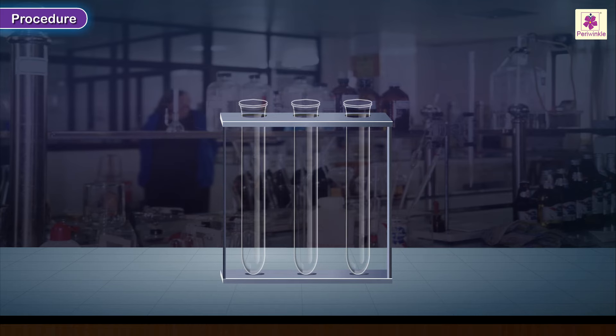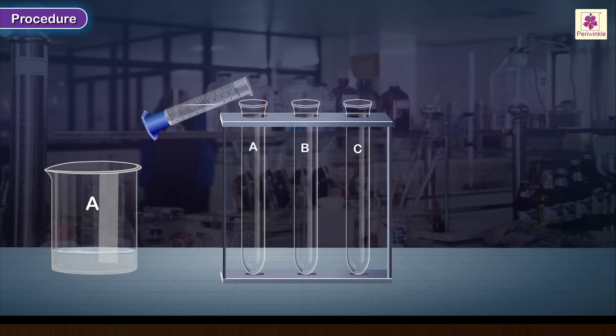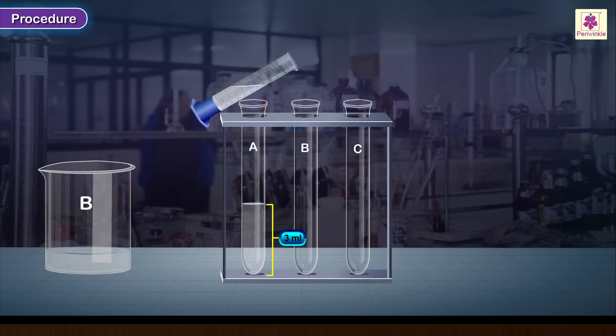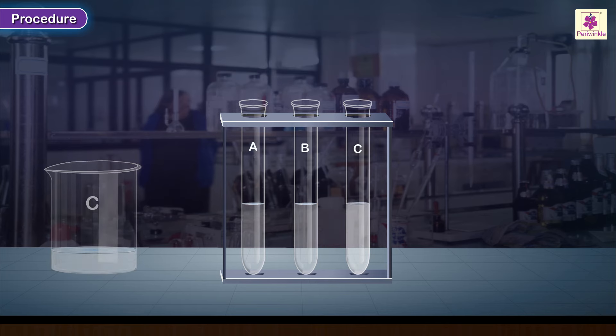Place 3 test tubes in a test tube stand and label them as A, B and C. Add 3 ml of the solution from each beaker to the respective test tubes.